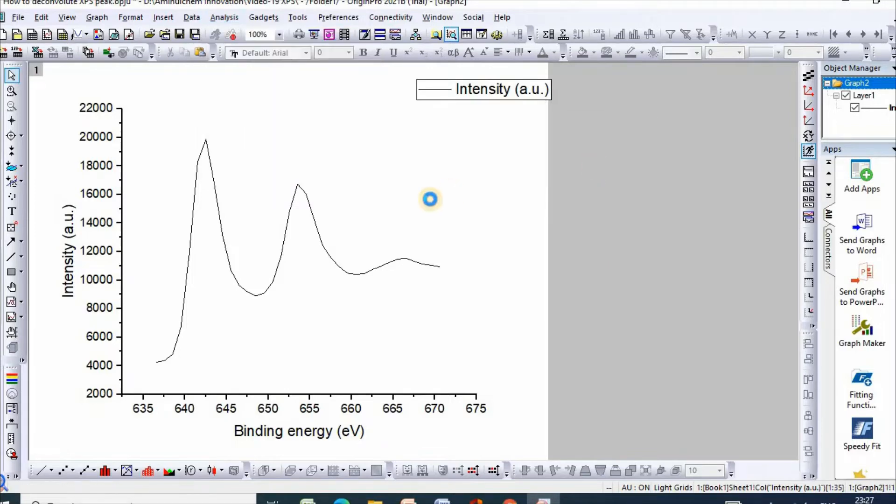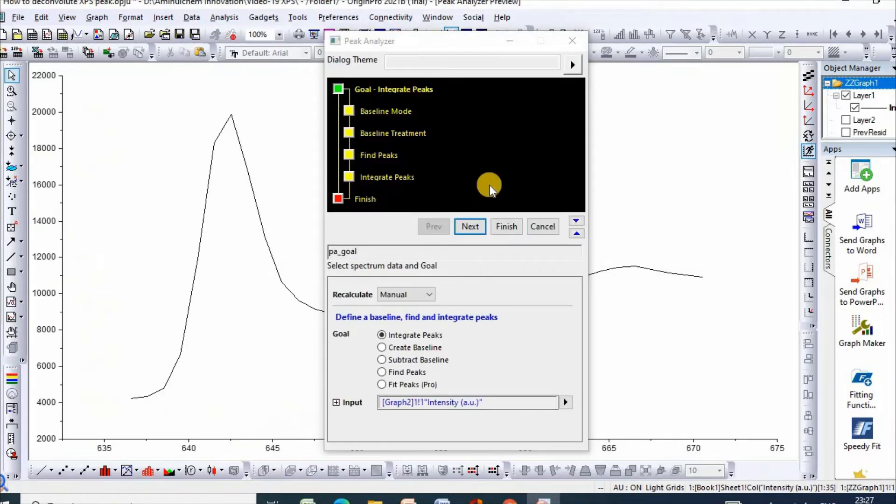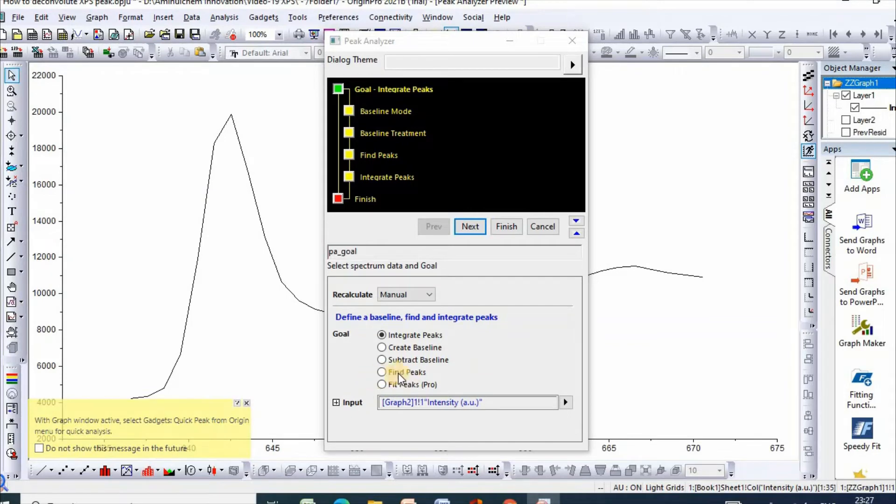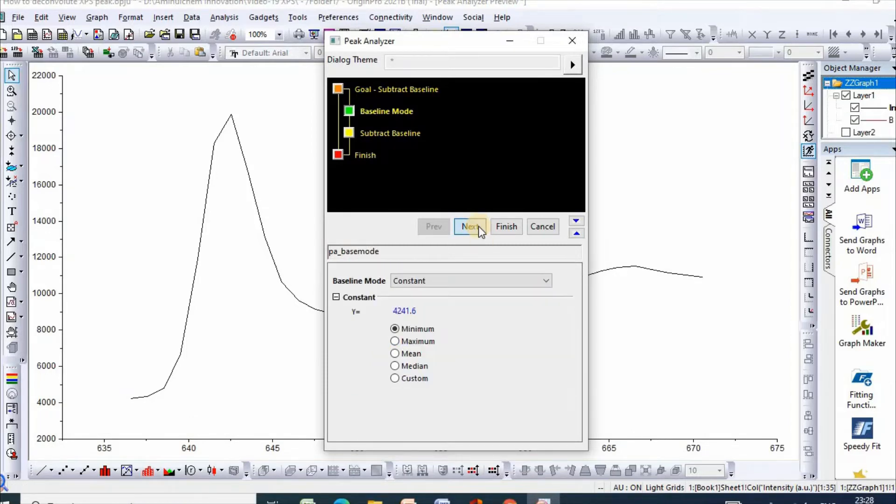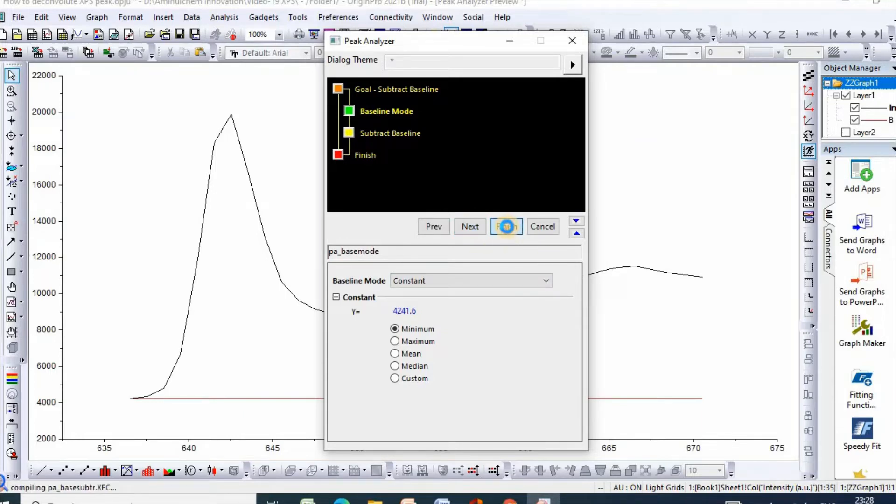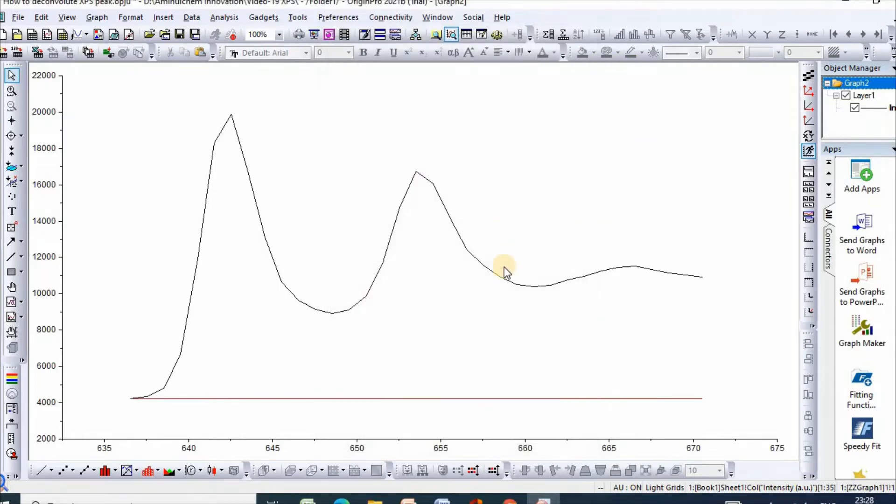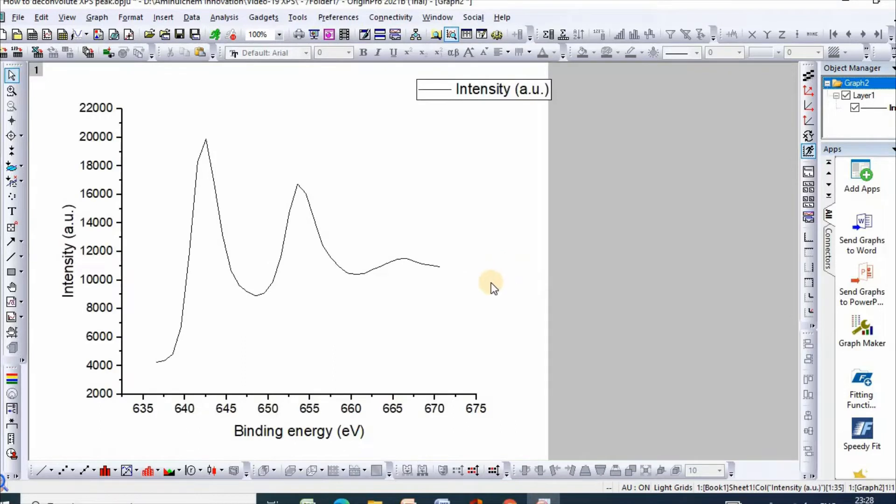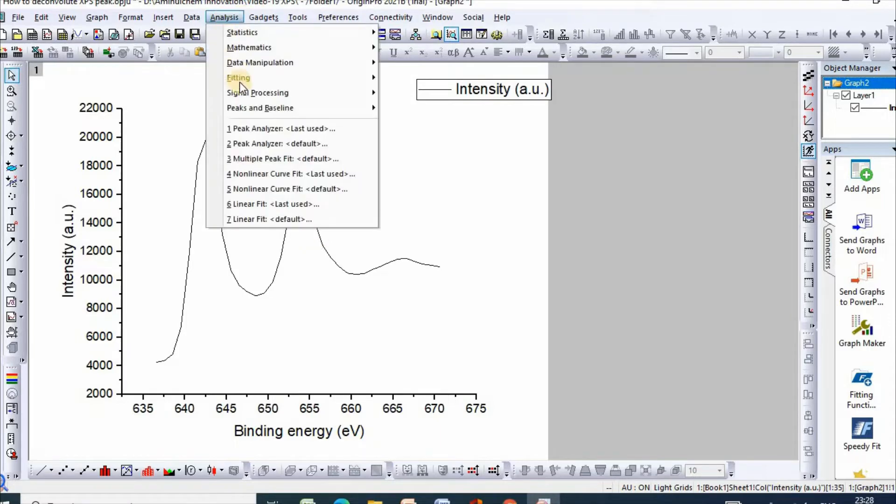Open dialog, then select Subtract, Subtract Baseline, then Next, then Finish. After baseline correction, go to Analysis, then Peak and Baseline.